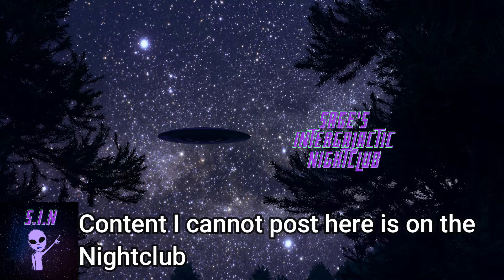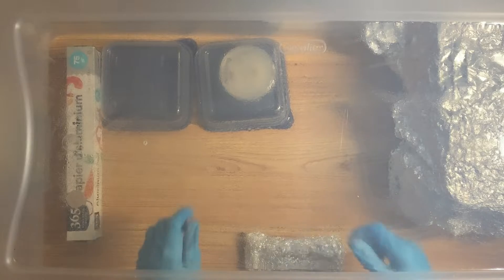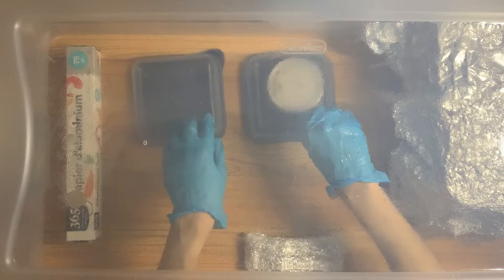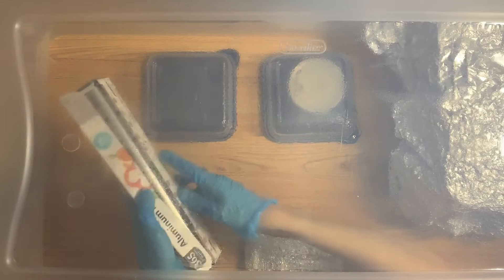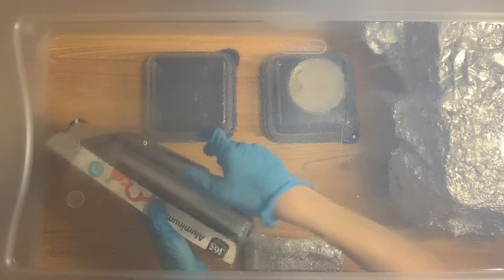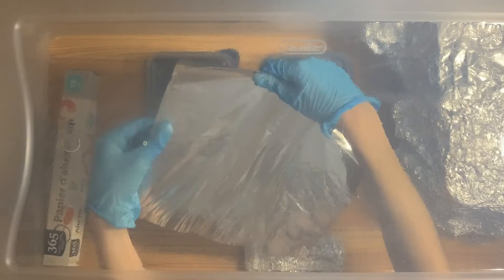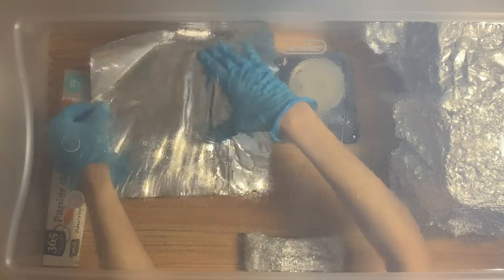I sprayed the sleeves, wiped down my sleeves, and then alcohol-wiped my gloves. You want to make sure your sleeves are also clean. I'm actually doing this basically naked, just with some boxers, and I took a shower before this — although I do it without a shower often. I always do take off my shirt at least.